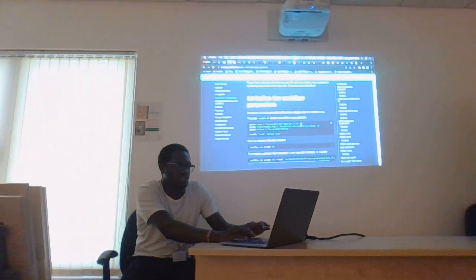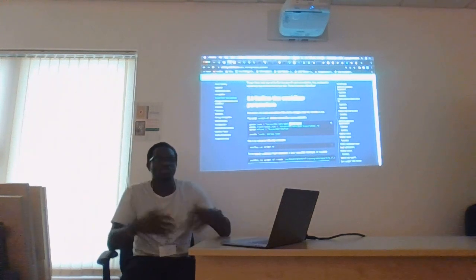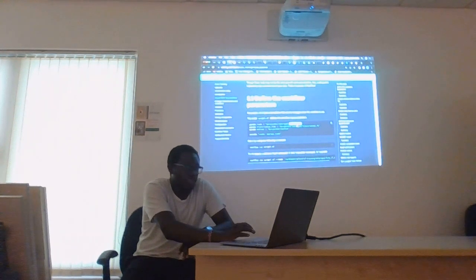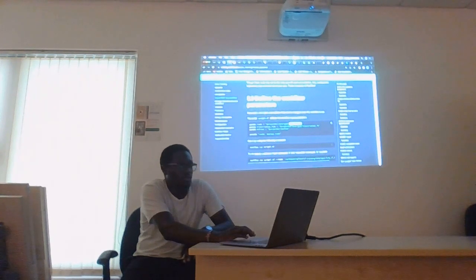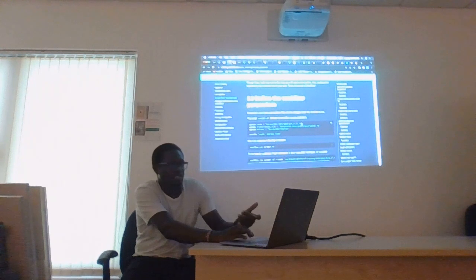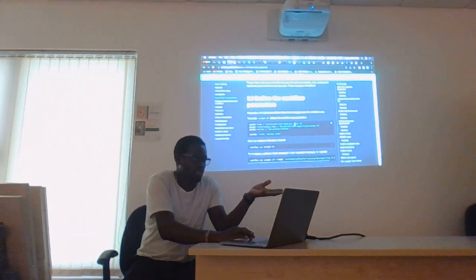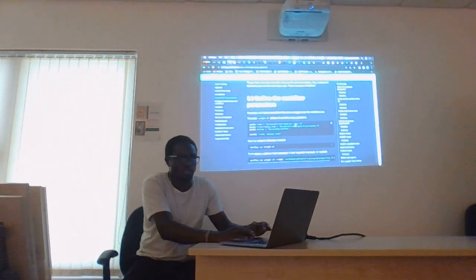So Nextflow is able to utilize this pattern recognition using wildcards, as we will see later on. But also you can explicitly specify the type of files you want using the naming convention of your files. So if you had, for instance, GAT underscore R1 and underscore R2, this would change accordingly.